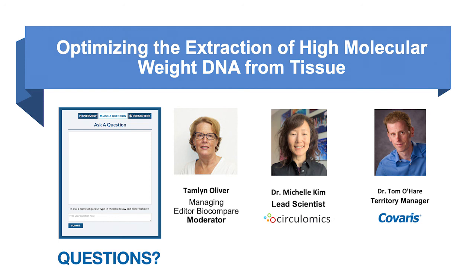Oh, for sure. We like the magnet. Obviously, our Nanobind is magnetic. It makes isolation easier when you can have something that's magnetic. But one issue that could happen with magnetic beads is if you have very high molecular weight DNA, it can be difficult to elute it off of the beads. Sometimes, for example, if your DNA sample is very viscous, often it will get so convoluted with the beads that it's difficult to get all the beads off, and then you might lose a lot of your highest molecular weight DNA.